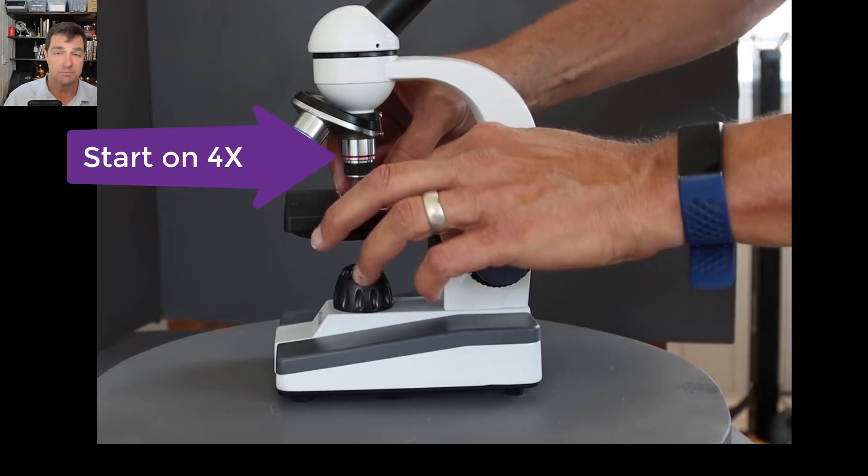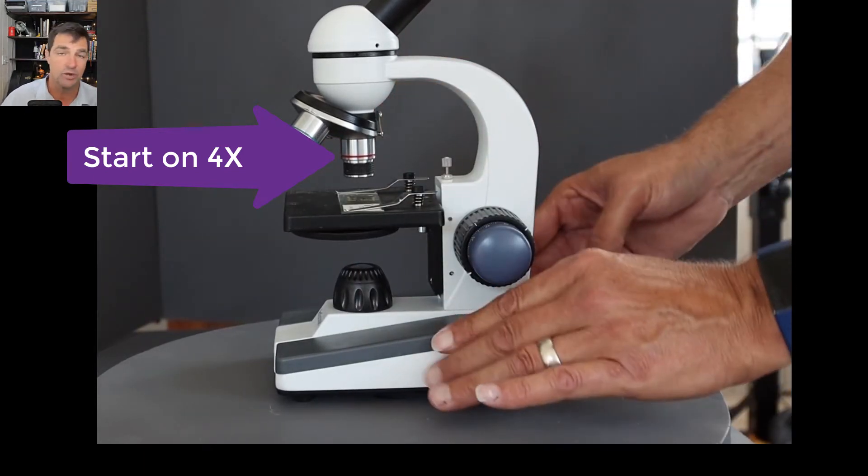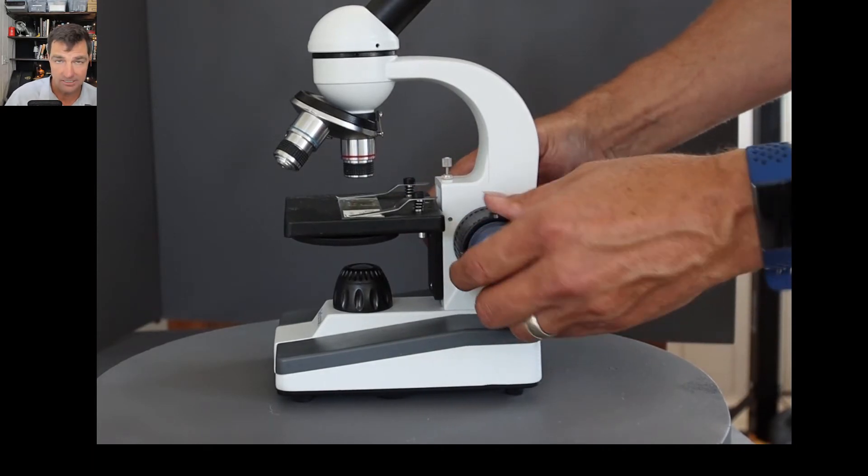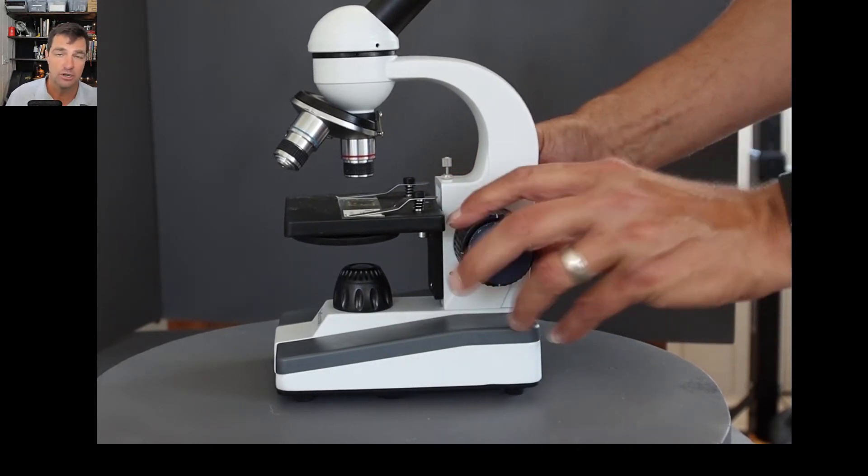In this particular microscope, it's the one with a red ring around it. It is the 4x objective lens, the shorter of the two.